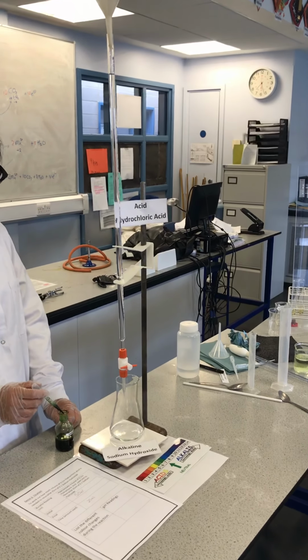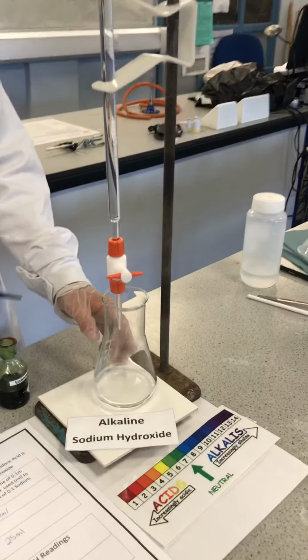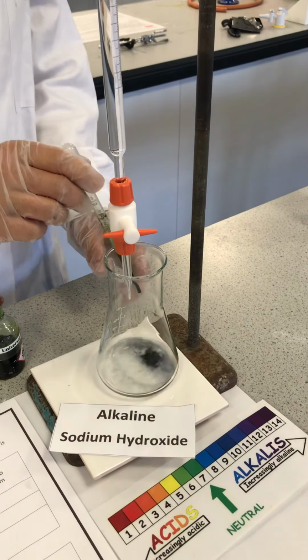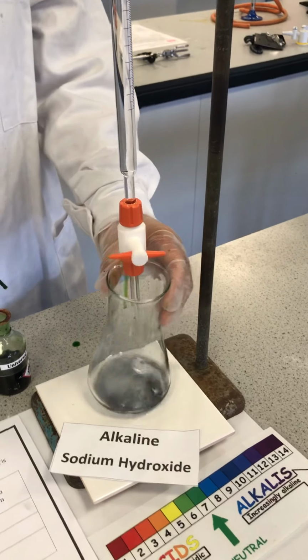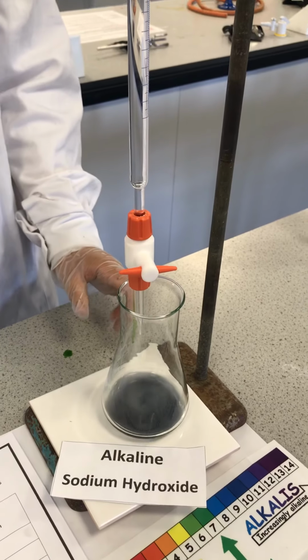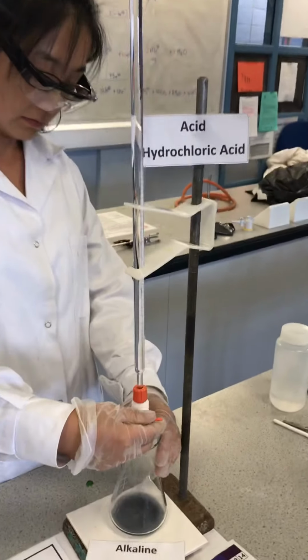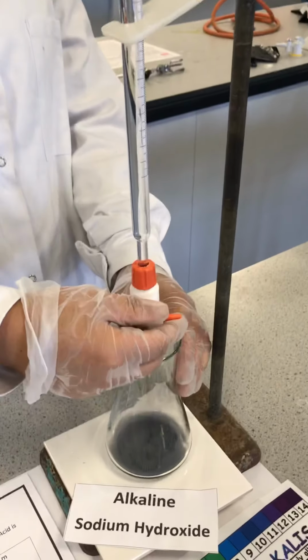We have inside a conical flask sodium hydroxide, which is an alkaline solution. We will drop some universal indicator inside and observe the color change. Now, using our burette, which has hydrochloric acid inside, we will drop some acid into the conical flask and see the color change.